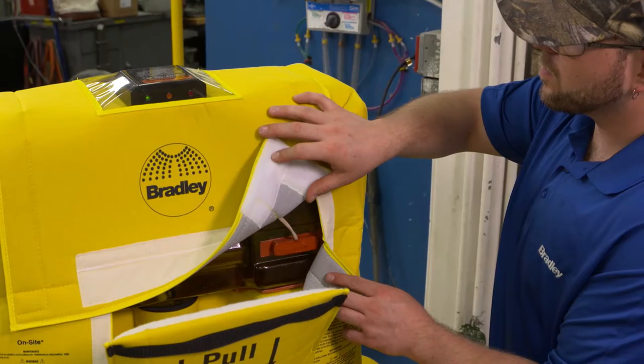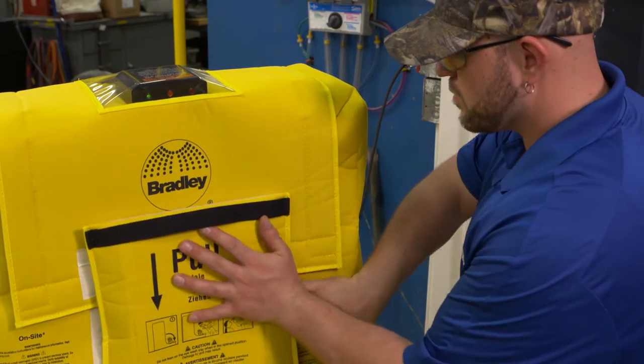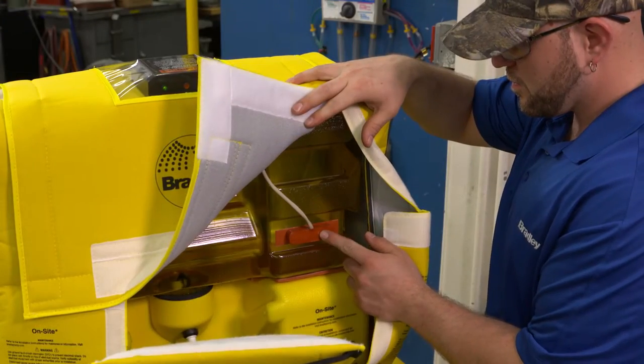Check and make sure the red light is off and that the green light is on. The amber light will only be on if the heater is operating. If the red light is still on, press the reset button again.